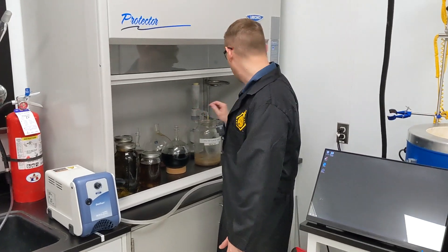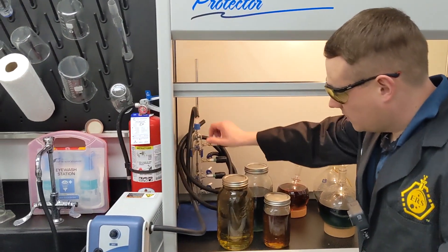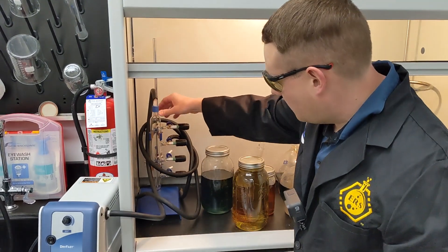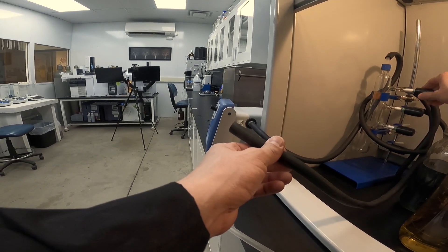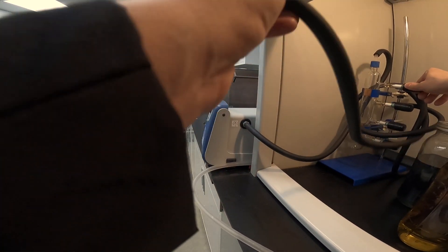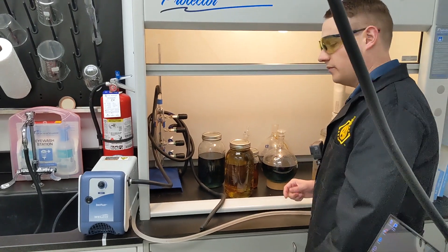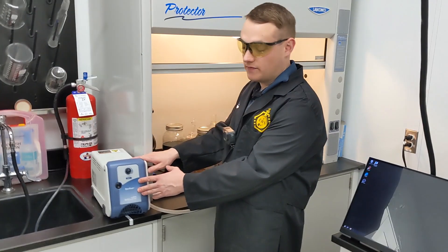Inside of the hood over here — I'll turn on the light so we can see — we've got a vacuum manifold system. The vacuum manifold is connected to the pump right at the top, and then we've got all these hoses coming off. The idea is that I can utilize this manifold to throttle different vacuums to different apparatuses like filtration flasks or whatever I'm doing that day in the lab. So this 2047 is going to be best for filtration.